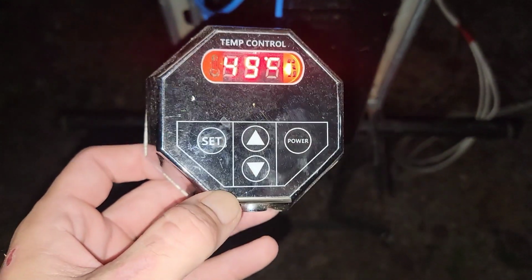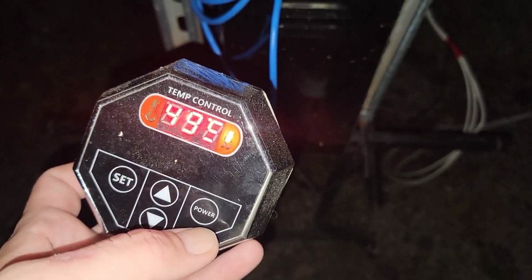Oh, we're getting to the point where this is getting ready to turn off and keep on climbing. Alright, let's go give our machine a check. As you see, it's running. Chances are that's because it's in a pressure relief, and this will be above 54.